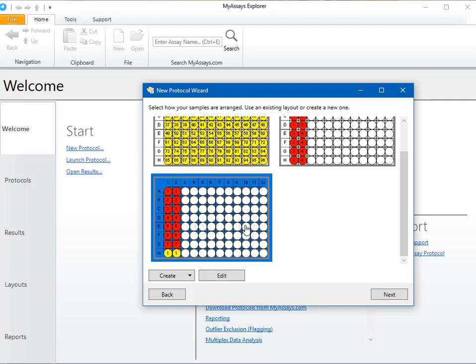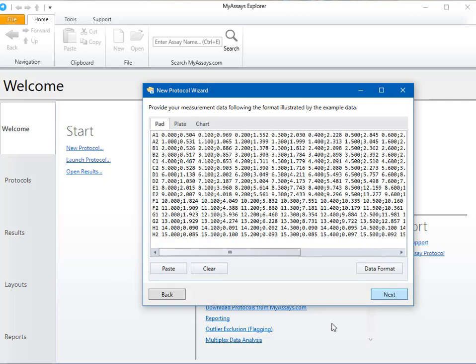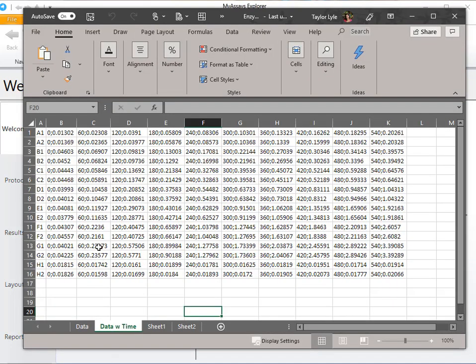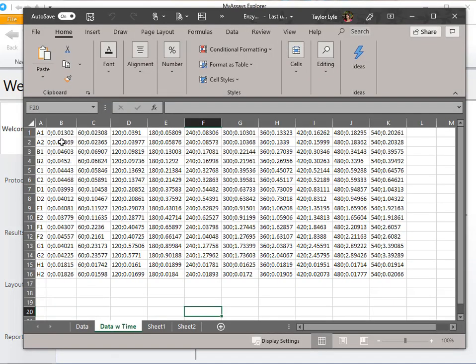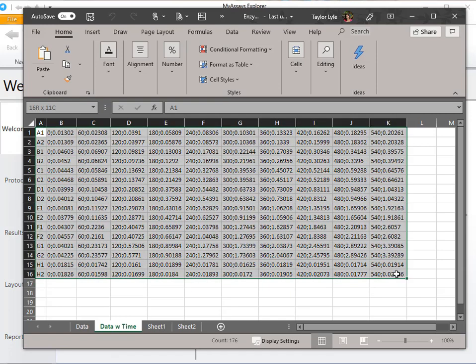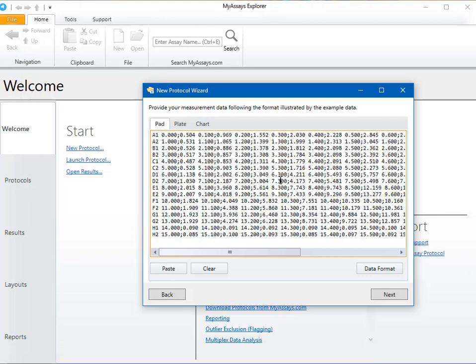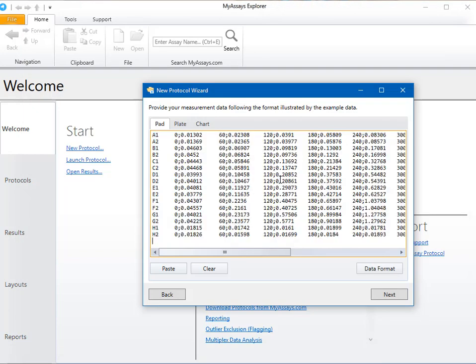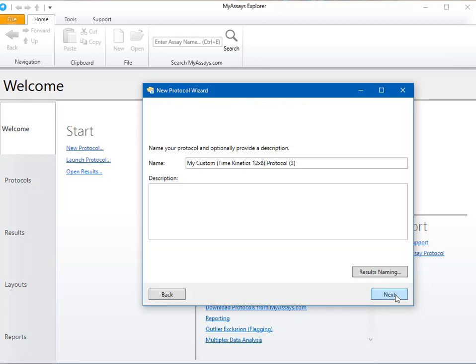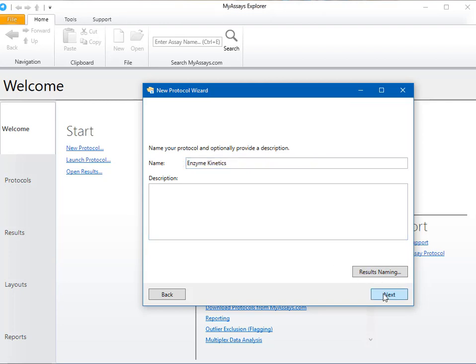I'll select the layout that has seven standards and one blank. In this example, I'm not measuring unknowns, and I'm only interested in the characteristics of the curve created using my standards. Next we can copy and paste in our data. And on the next screen, name our protocol and optionally provide a description. Finally, we can review our protocol configuration and press Finish to save and launch the protocol.